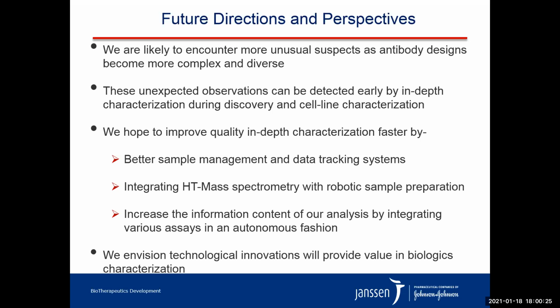To improve quality in-depth characterization, we see opportunities for improvements in sample preparation, such as sample management and data tracking systems, integrating high-throughput mass spectrometry with robotic sample preparation, and increasing the information content of our analysis by integrating various assays in an autonomous fashion. We envision that we can innovate using novel technologies and that this will provide value in biologics characterization.